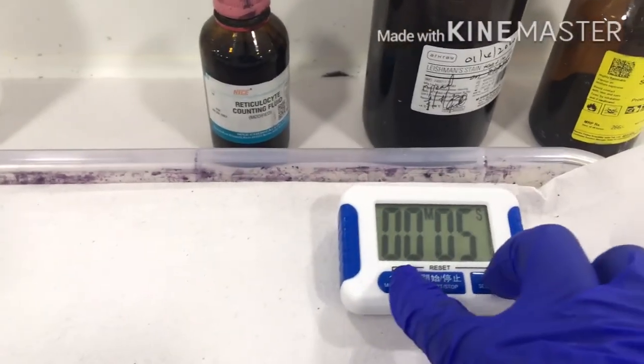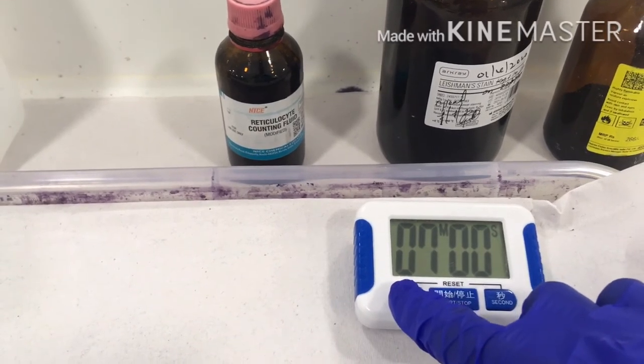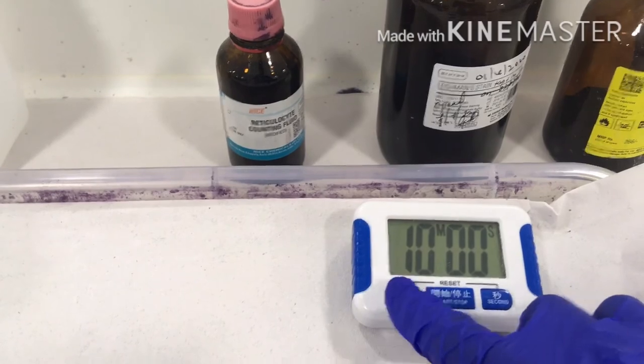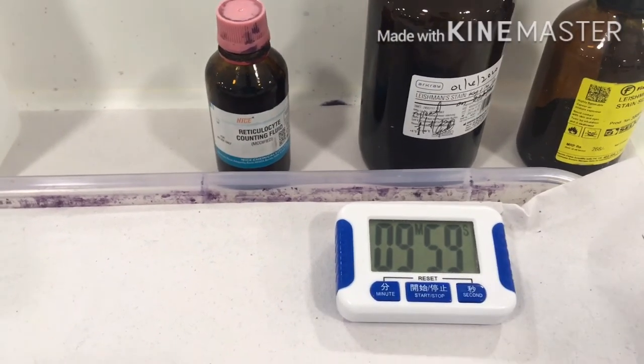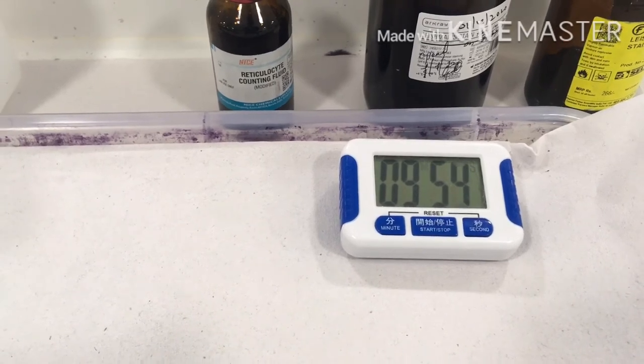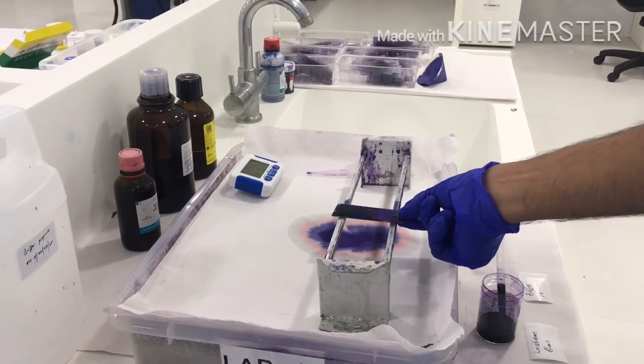After adding the buffer, how many minutes do we have to wait? Here I am putting 10 minutes in the timer. Usually there are variants, some labs use 12 minutes, some labs use 8 minutes, so it varies. Here I am using 10 minutes. I wait for 10 minutes. So 10 minutes are over.